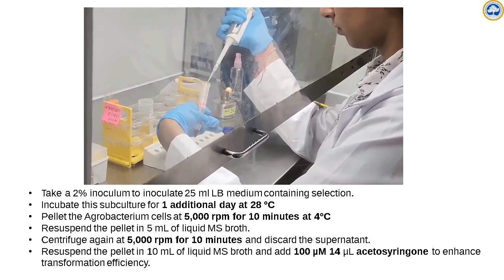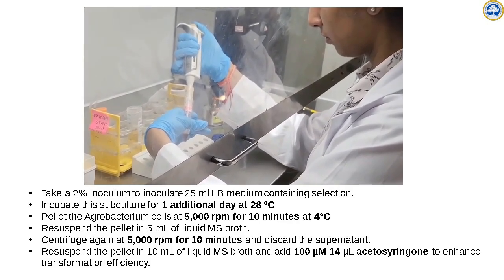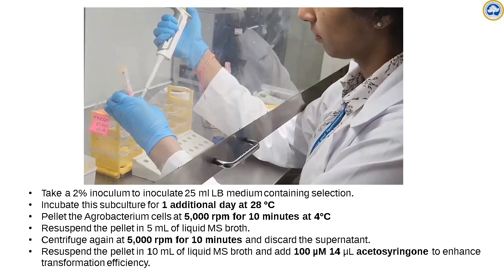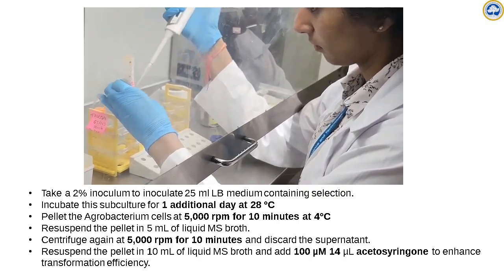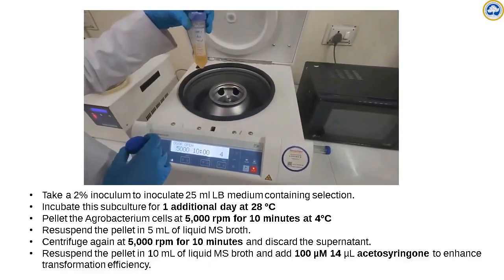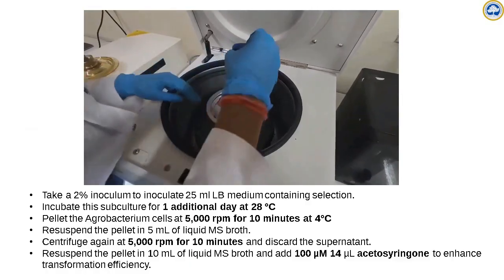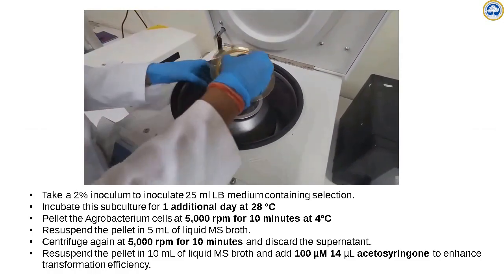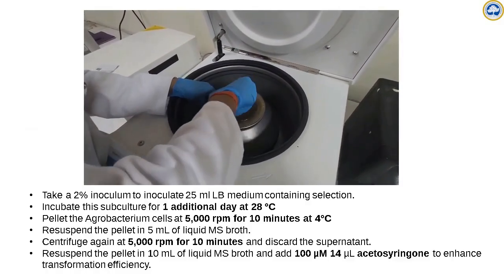So what we do, we make 25 ml LB broth and we add the selection kanamycin and rifampicin, 50 microgram of kanamycin per ml and 10 microgram of rifampicin per ml, and then we add 2% or 1% inoculum from the mother culture that was raised. So this we culture for another 1 day so that the OD reaches 1 to 1.2, and then we pellet down the cells. The pelleting can be done at 5000 rpm for 10 minutes or 5 minutes, or 10,000 rpm for 1 minute, preferably at 4 degrees Celsius.